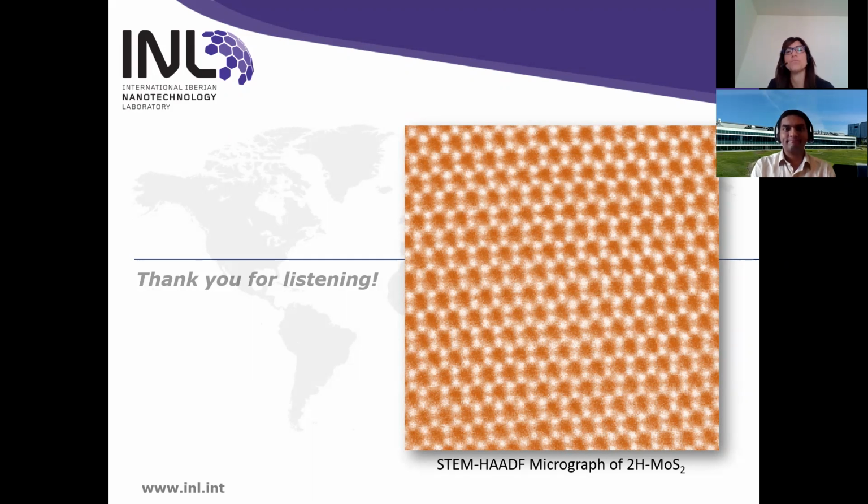Thanks, Miguel, for your question. In fact, the dual beam is meant for a certain purpose, like if we want to look at different materials which are relatively hard.